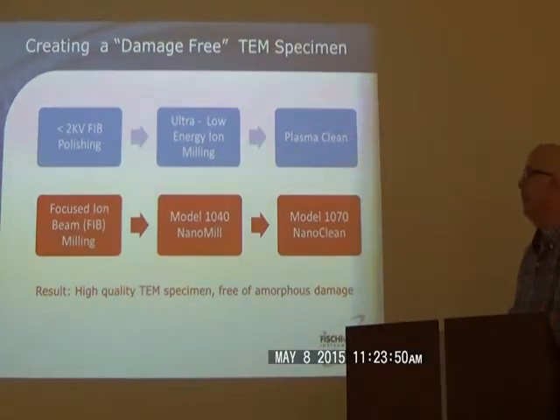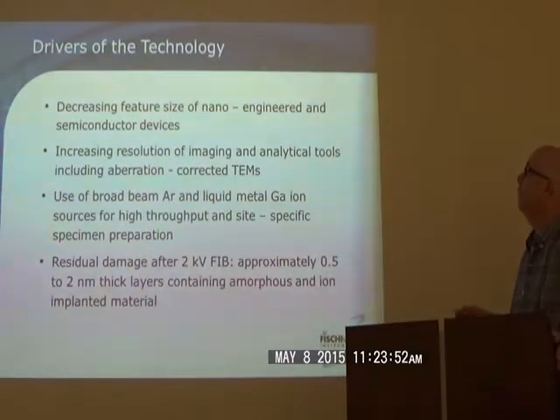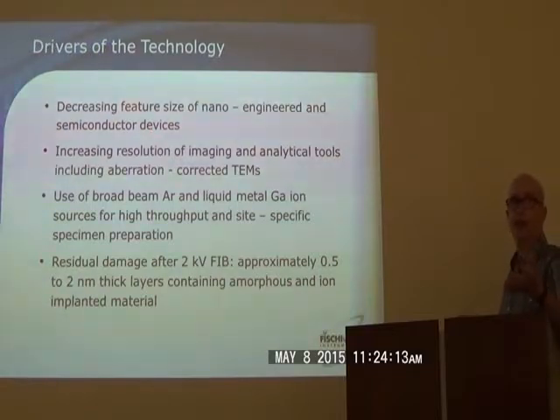Next slide, please. And what were the drivers of the technology? For those that haven't been with us, we've been working on this project since about 1999 or 2000, when it was first envisioned. Even at that time, what we saw was the decreasing feature size of some of the stuff that makes up a given sample. For instance, semiconductor samples that have all the little circuits, the devices, the building blocks called transistors, are less than 20 nanometers themselves now.